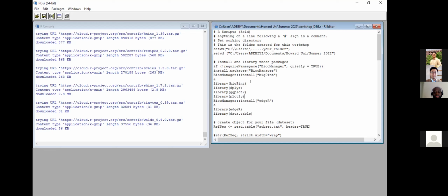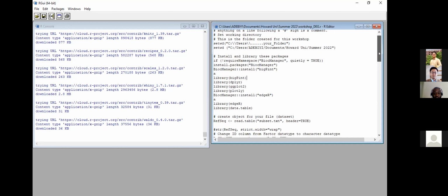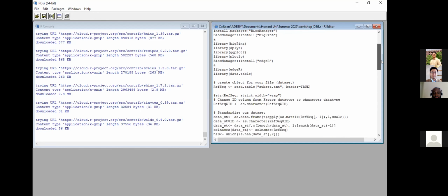Okay. This should be done by now. All right. So still running in the background. See if it's done.